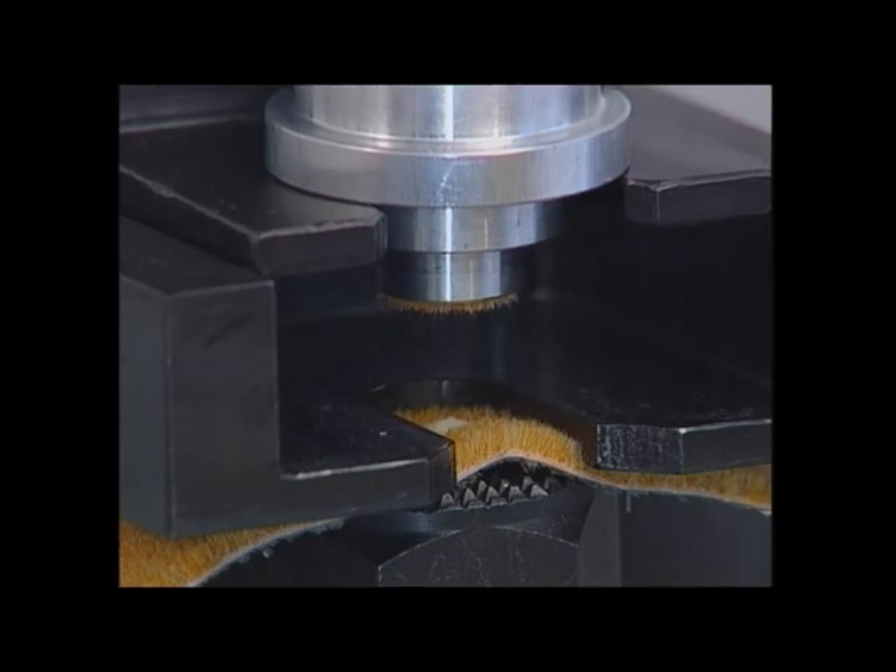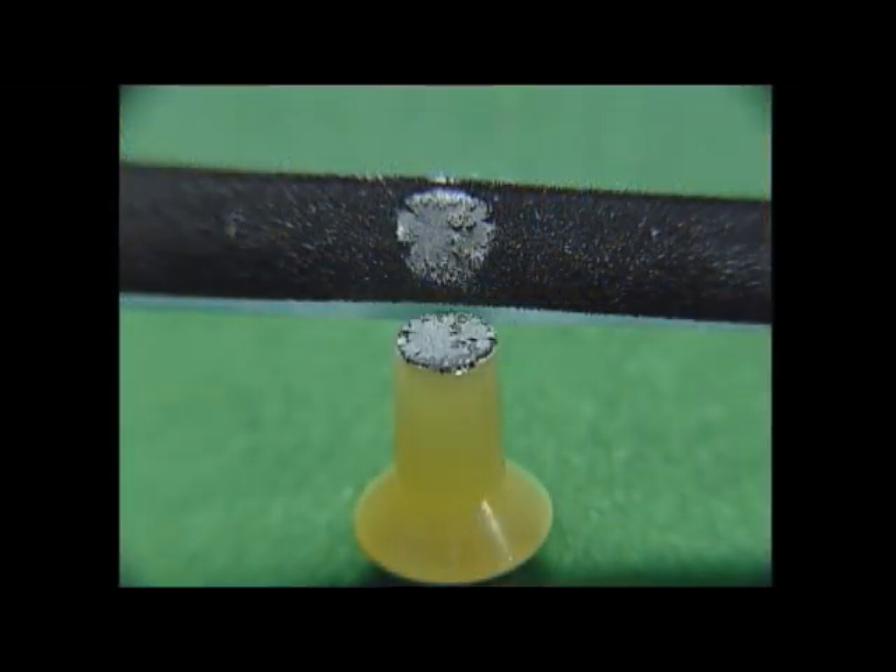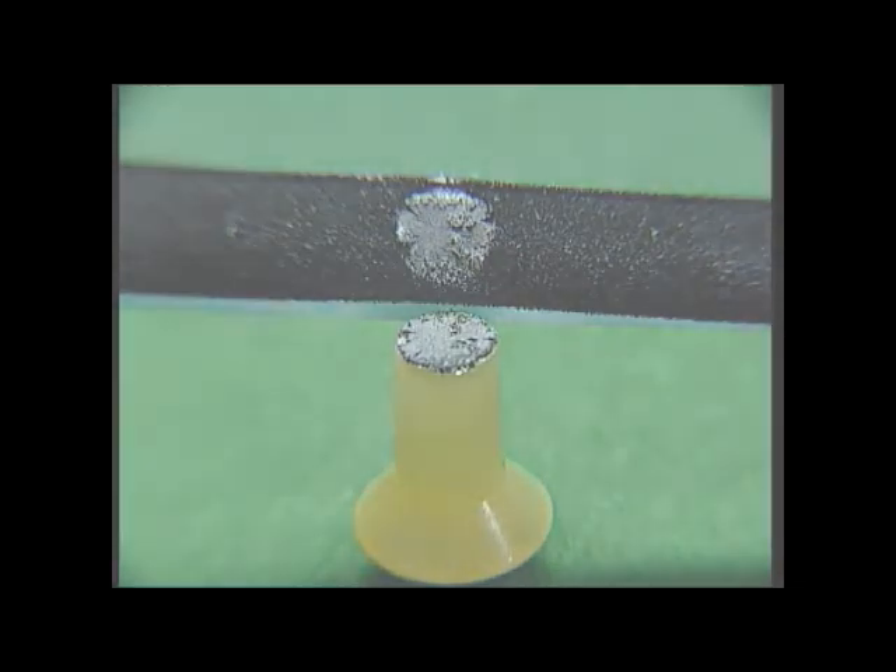In this example, the Flock is completely torn out of the adhesive. Most of the time, the adherence strength is so high that with rubber profiles, sometimes even the rubber itself is torn off.